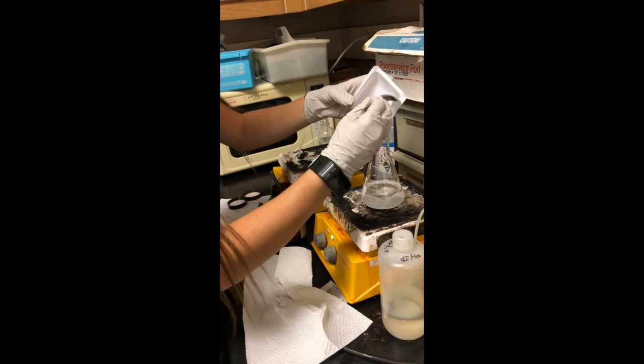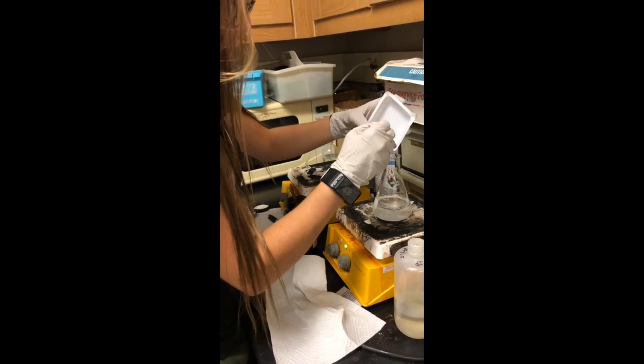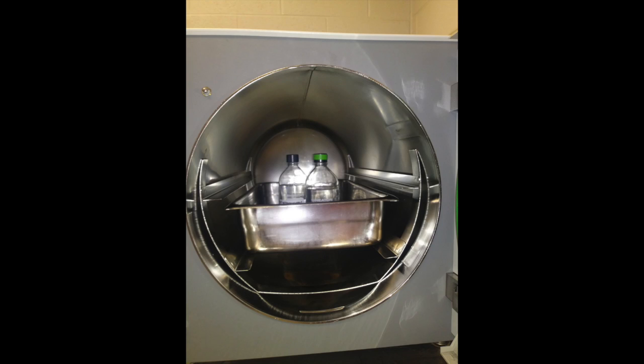We then used the filtered water to make contaminated and uncontaminated tap media by following the tap recipe and adding the different types of filtered water. We then autoclaved both flasks for an hour.